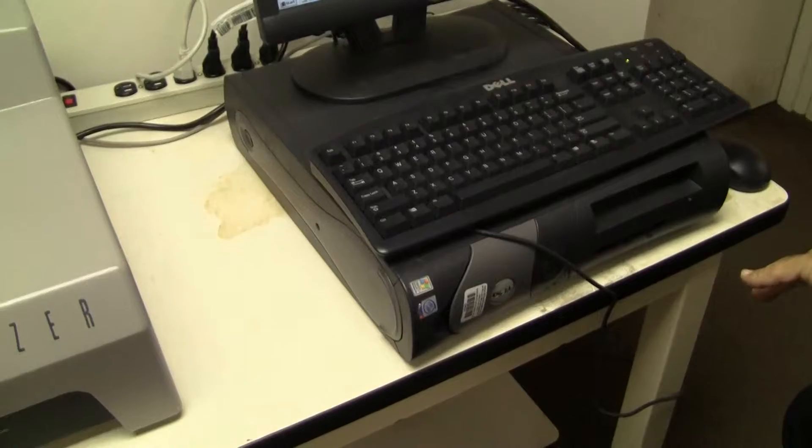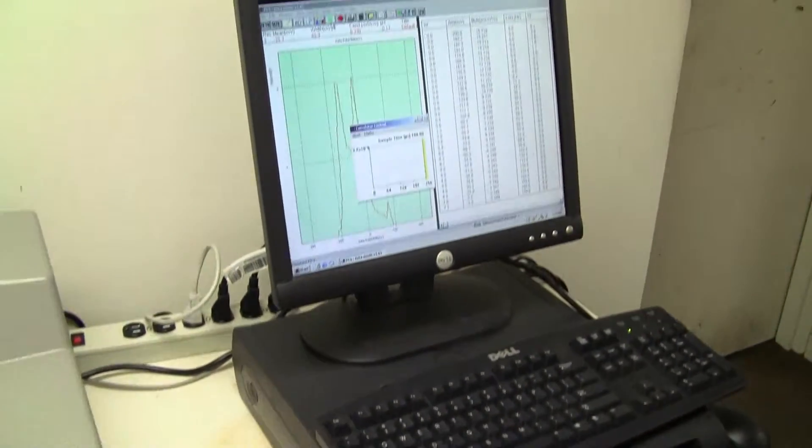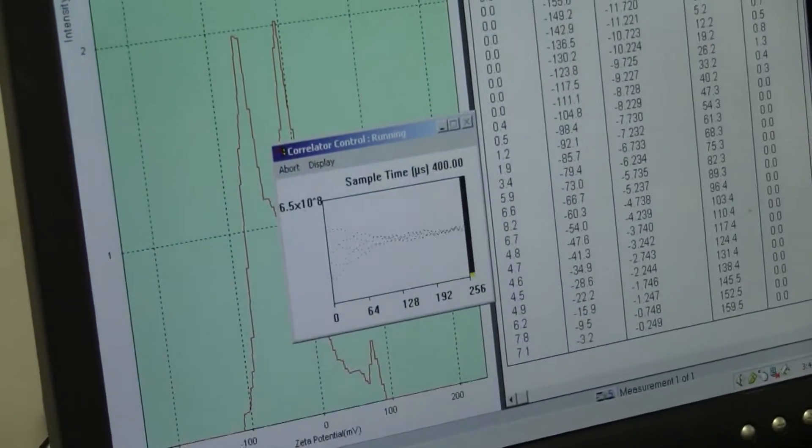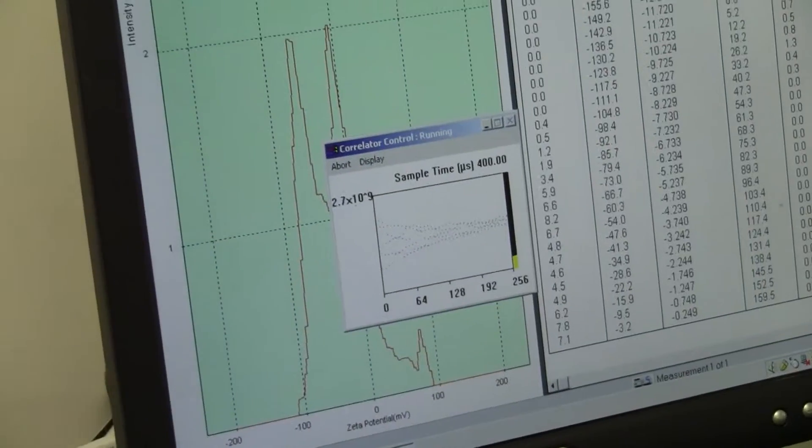It comes with a Dell computer. Instruments nicely picking up the sample.